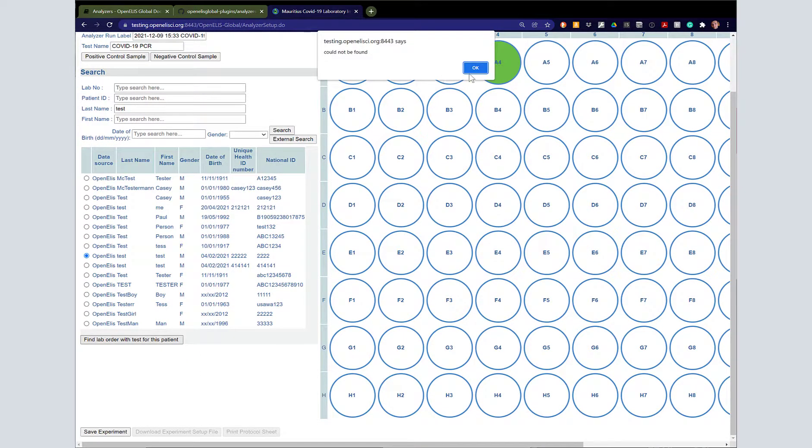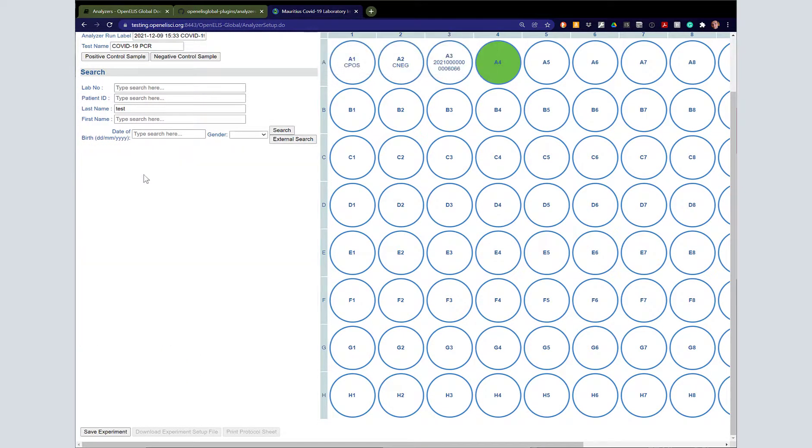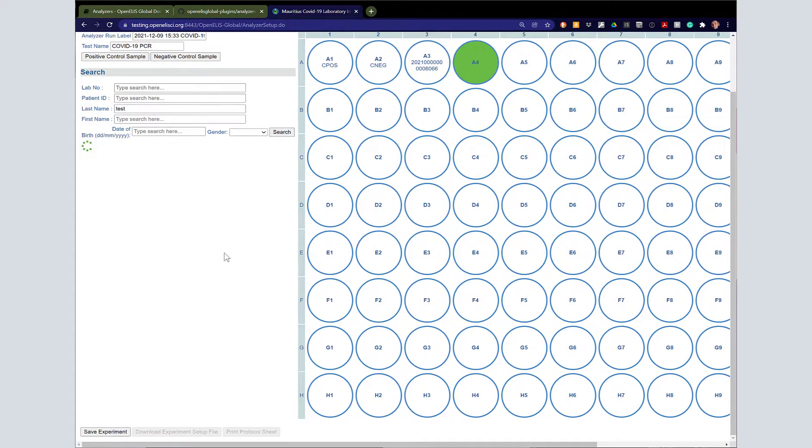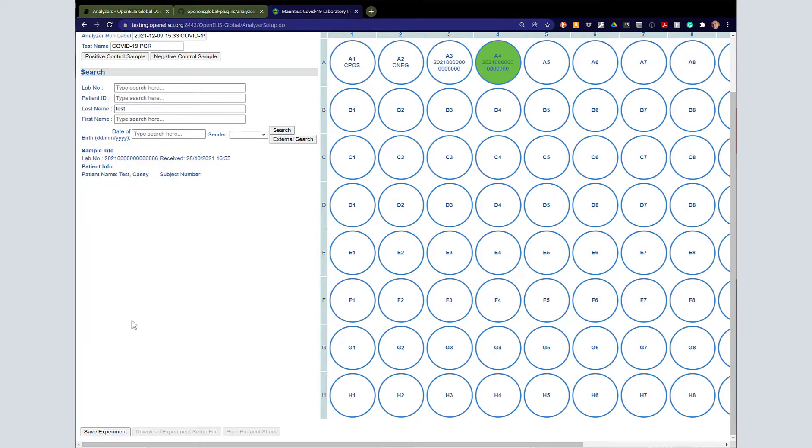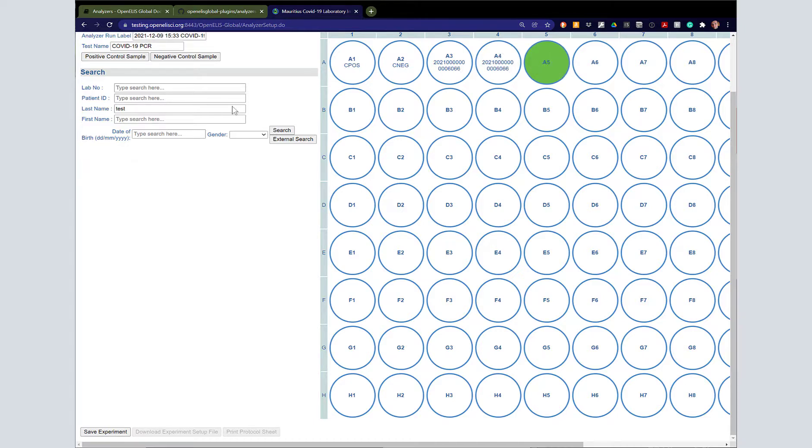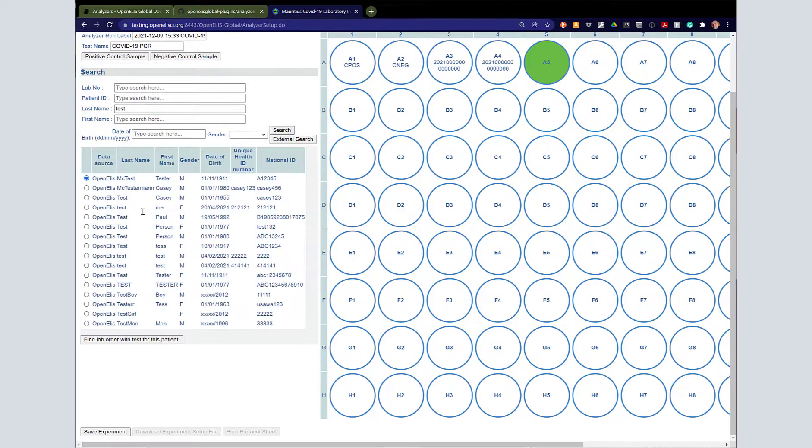Of course, in an actual production environment, this plate would be full before we went on to the next. So we've found a couple of orders. As you saw, if there's not a COVID-19 PCR test, it will show up and say test could not be found.